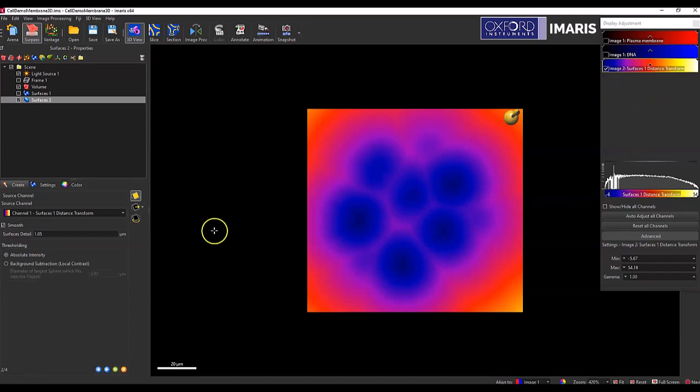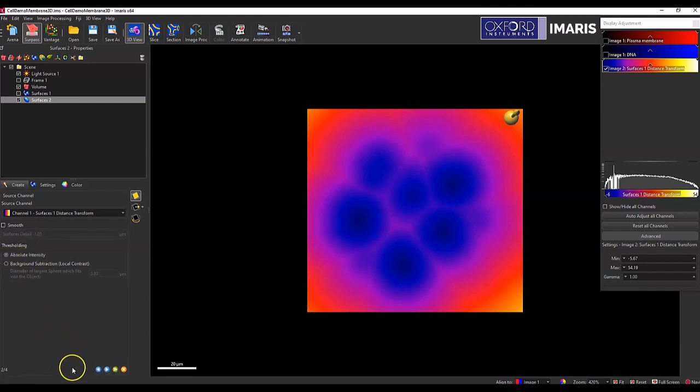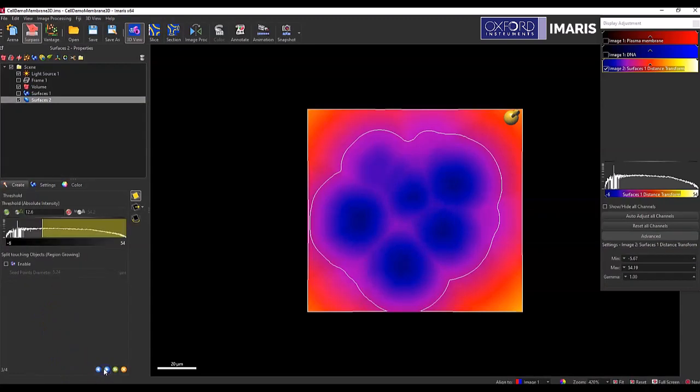So once I have that in, I will now create my dilation surface and the way I go about doing that is first remove any type of smoothing factor and you need to be using thresholding that's based on absolute intensity, not background subtraction.